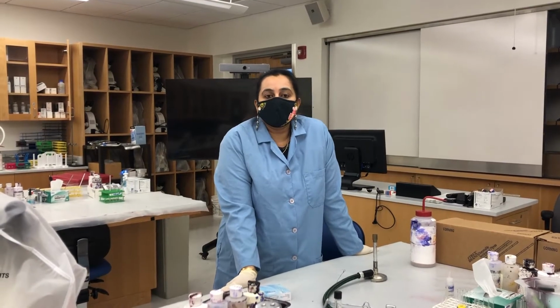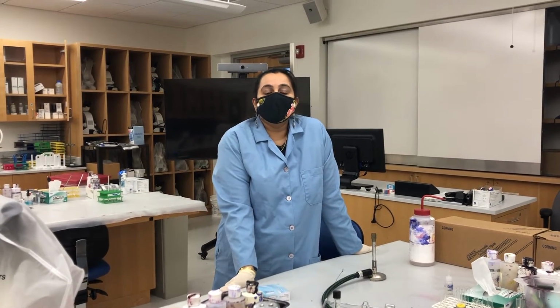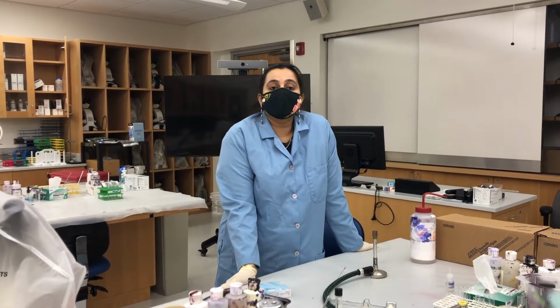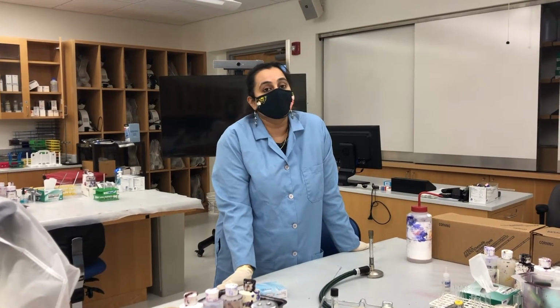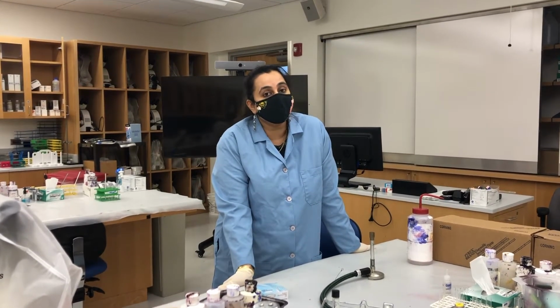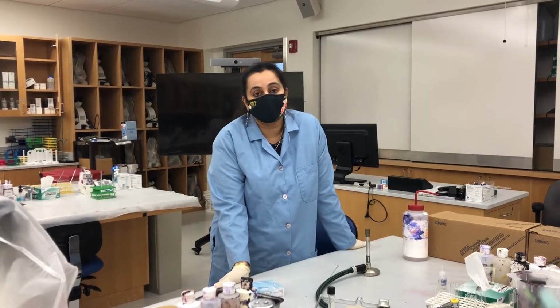As I already explained in your chapter 3, I believe, differential staining technique uses two different kinds of stains. Okay? So you have one stain that is known as a primary stain that is used and added to all the cells. You wash it off, you then go with another stain, you use the decolorizer to wash the stain off, and then you go with the second stain to differentiate the gram positive cells from the gram negative cells.